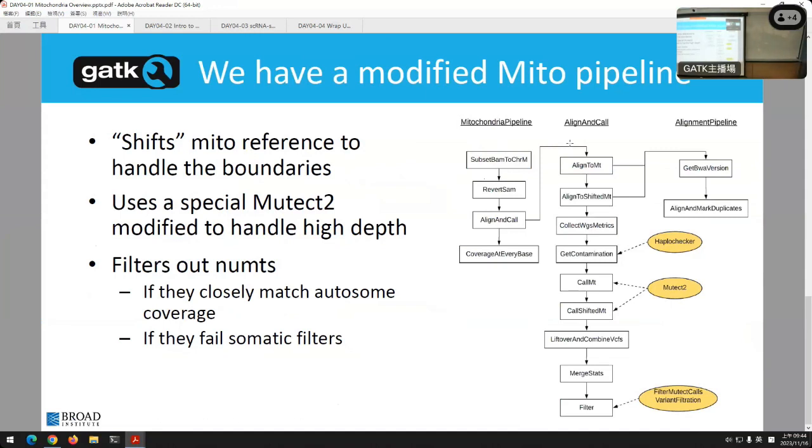Now, remember I mentioned mitochondrial DNA being circular causes a problem? When you're trying to lay out the bases on a chromosome, you pick a start, you pick an end, and you align to that. Well, there's no real start or end. I guess that's just a circle thing, by definition. So the problem is, how do we handle that? To some degree, you pick an arbitrary point in our reference, we cut there and say that is 0, and we just number our way around.